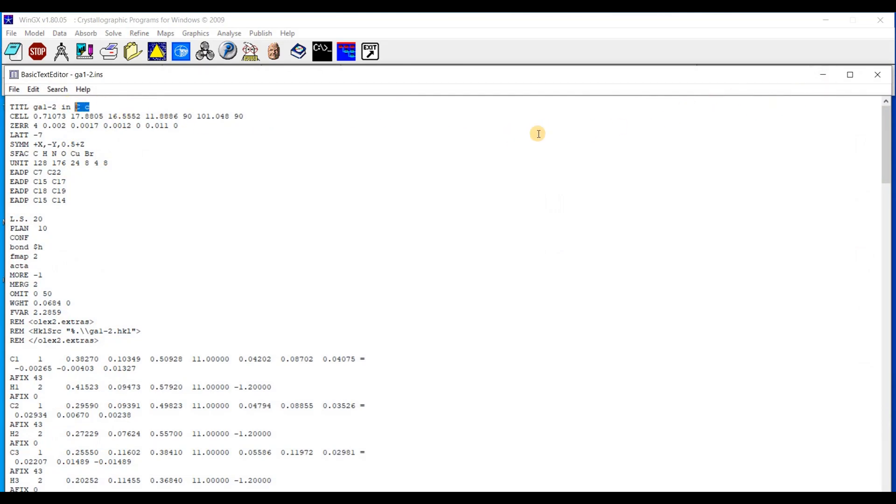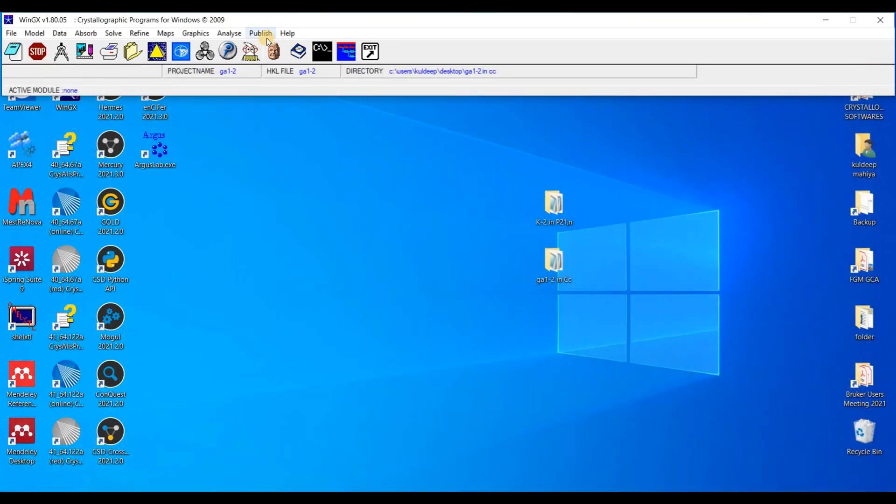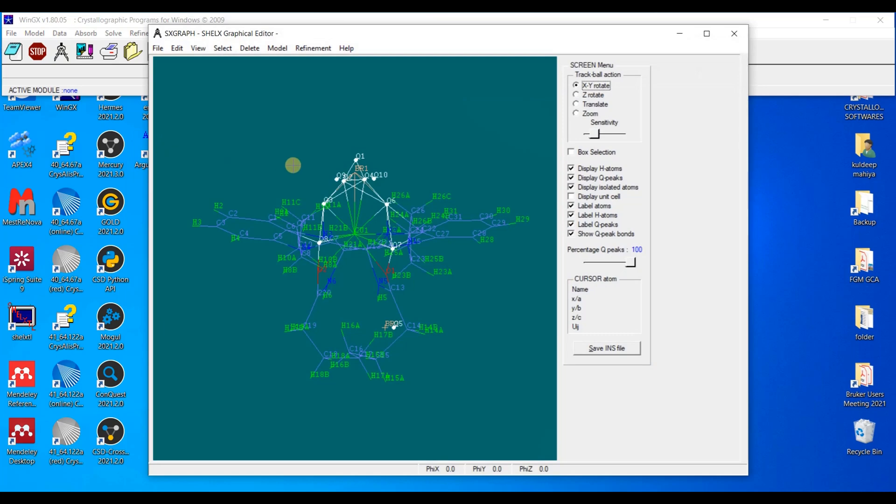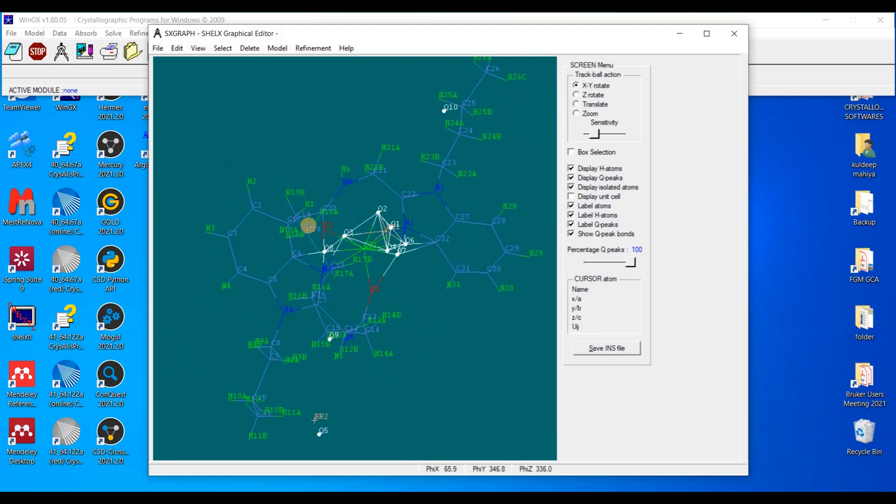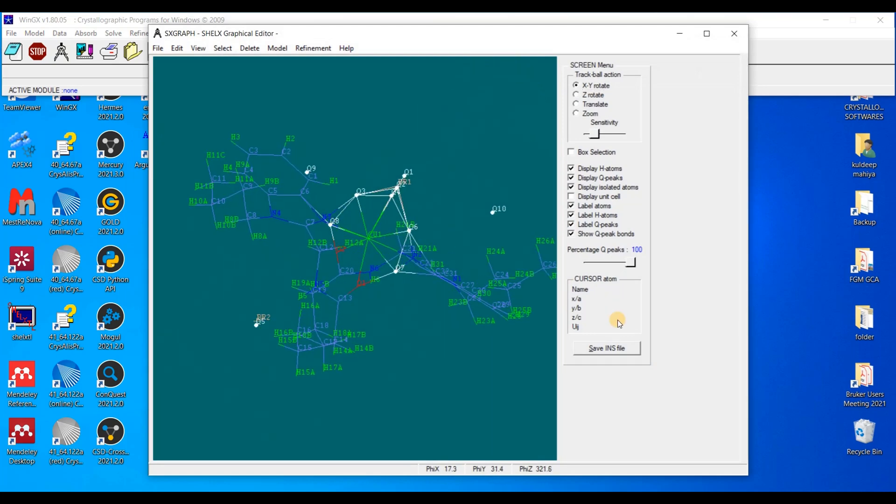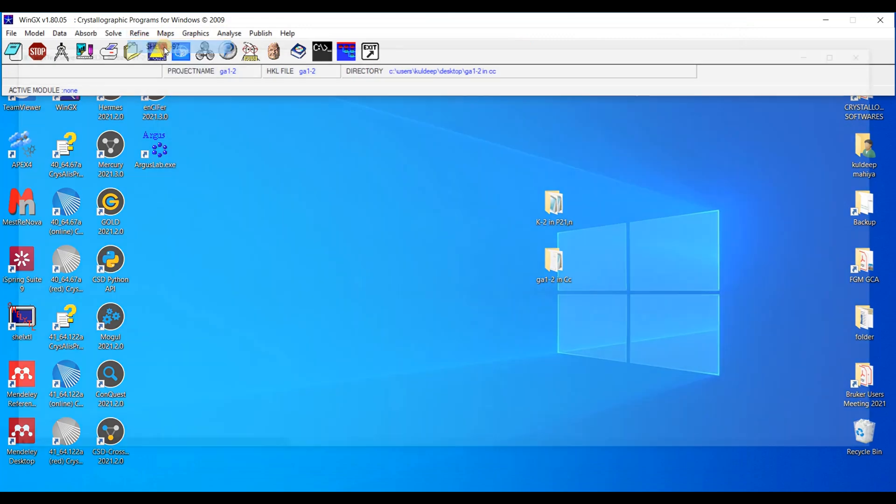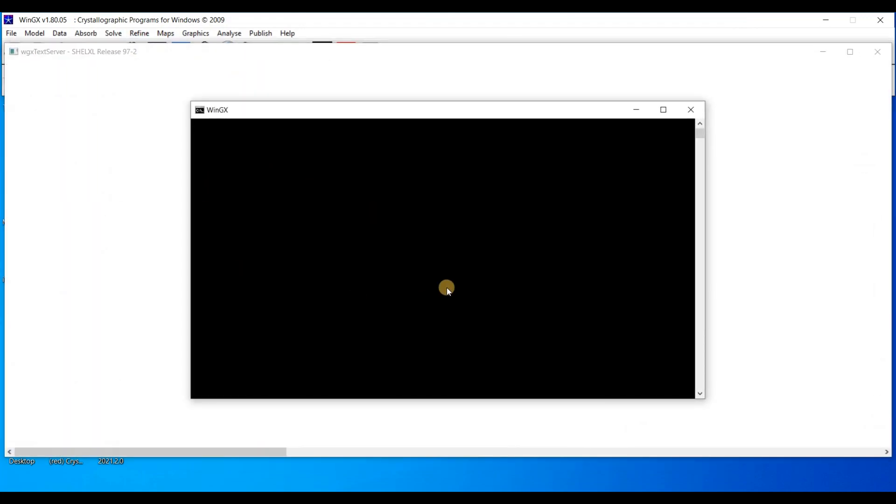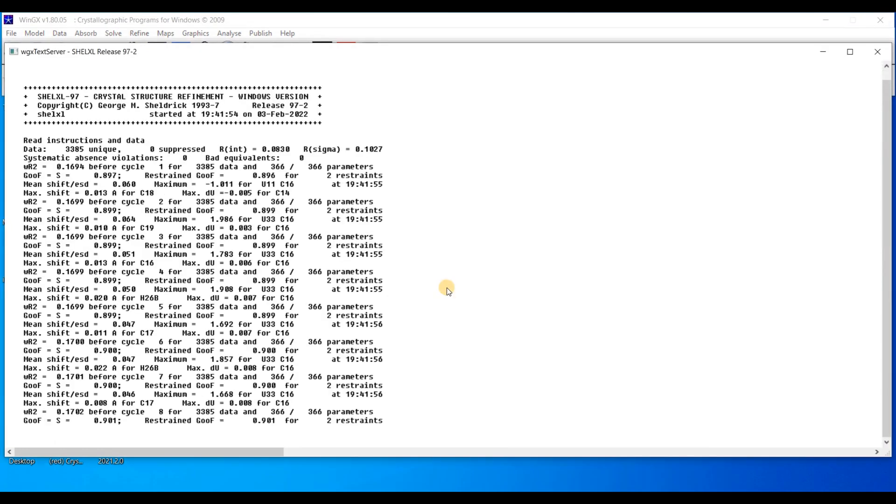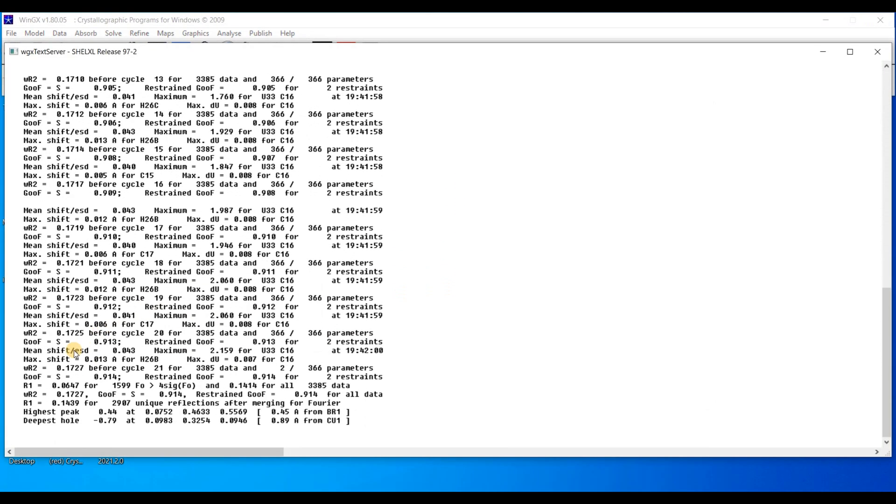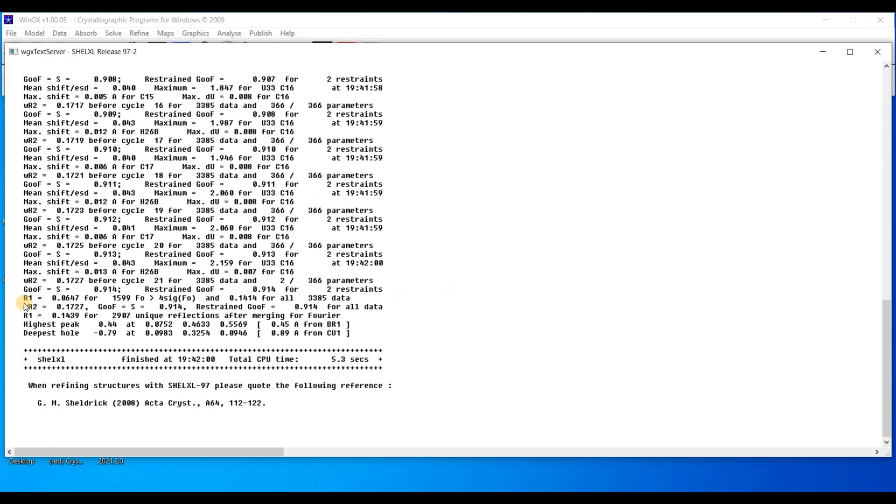So here the space group is CC. I have to change this space group CC into C2/c. For this, this is the quality structure. Refine once with ShelX97.